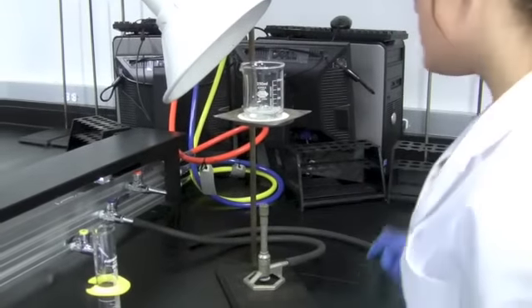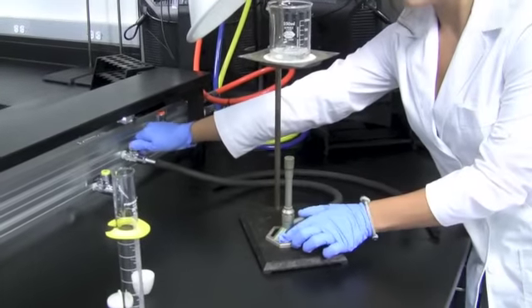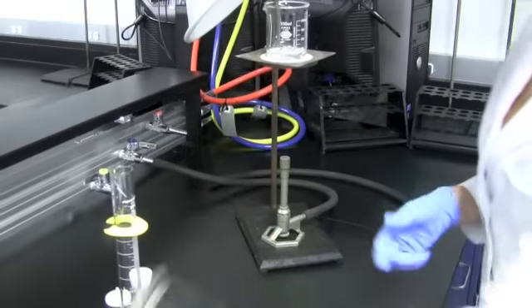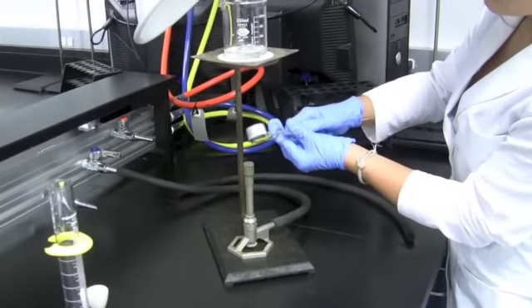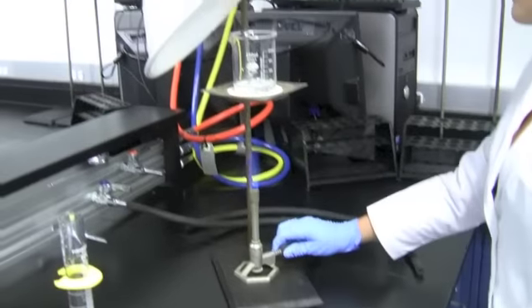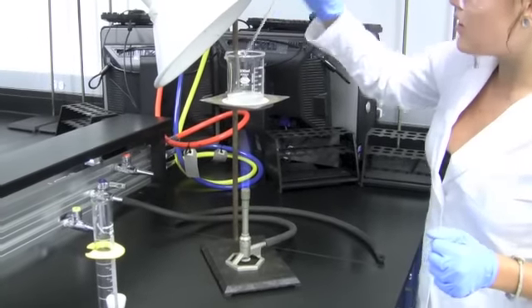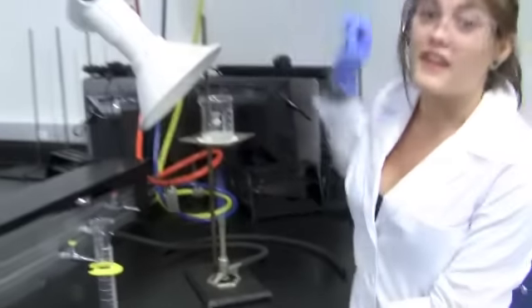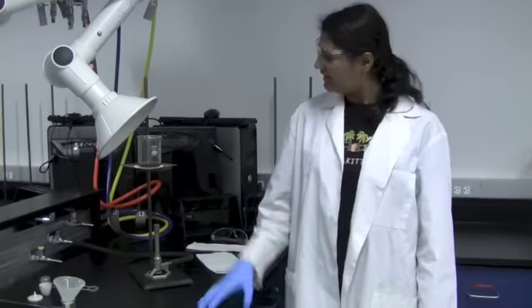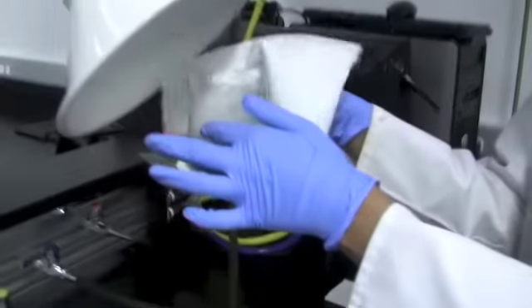We need to heat the solution, so I've hooked a hose up to the gas. You turn on the gas, and we're going to slowly heat the solution. Make sure that it's under the hood so that the hydrogen gas can get sucked up into the vacuum. Now, once your aluminum dissolves, you might have some black particles remaining. They're going to look like this.